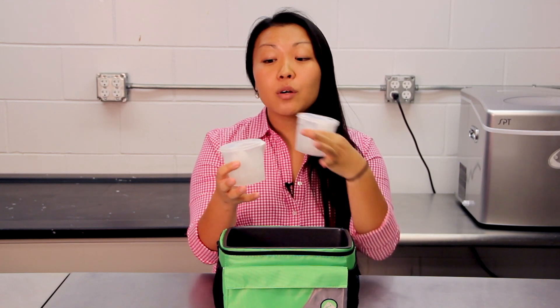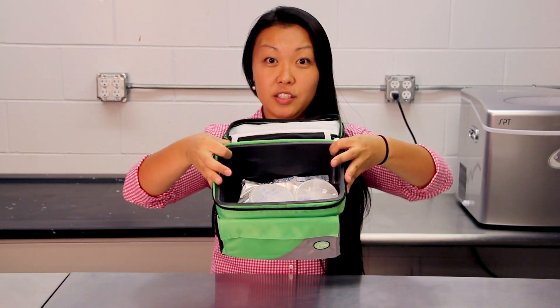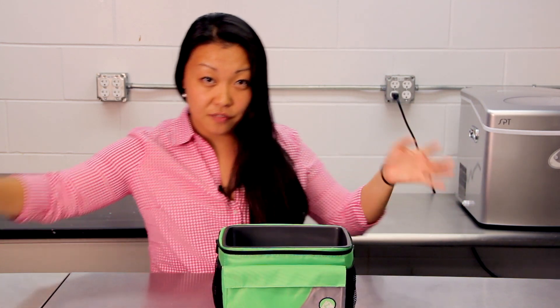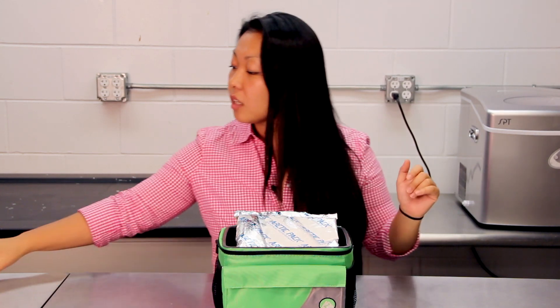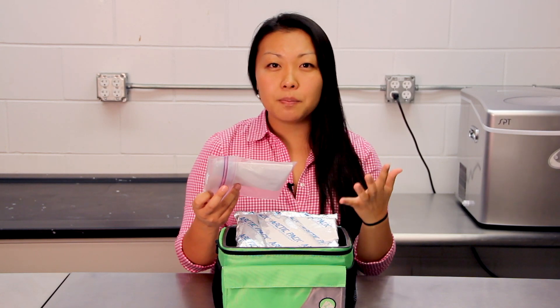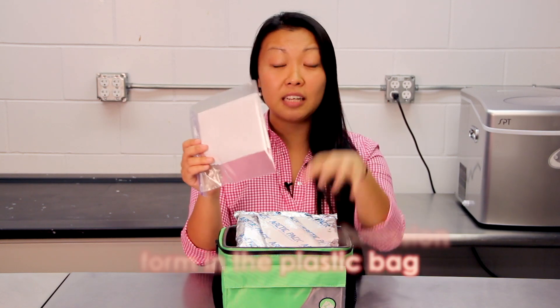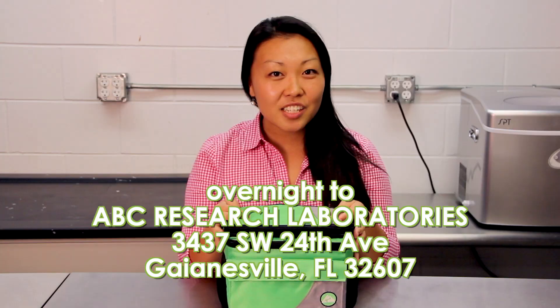To be extra cautious, you want to wrap the specimen cups in bubble wrap — this is your second layer. Your third layer is going to be another freezy pack, which will help the samples stay cold. Your last and final layer is going to be your sample submission form. That's what the Ziploc bag is for — it keeps your sample submission form from getting wet from the freezy packs. Go ahead and layer it in, zip it right up, and send it overnight via FedEx or UPS to us.